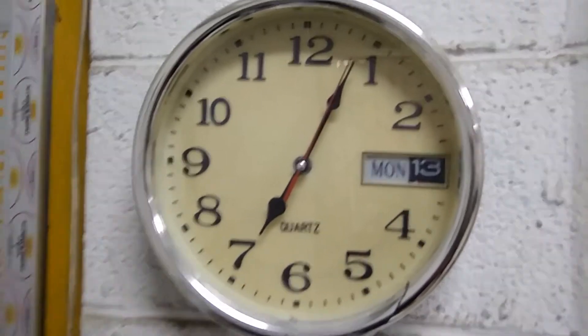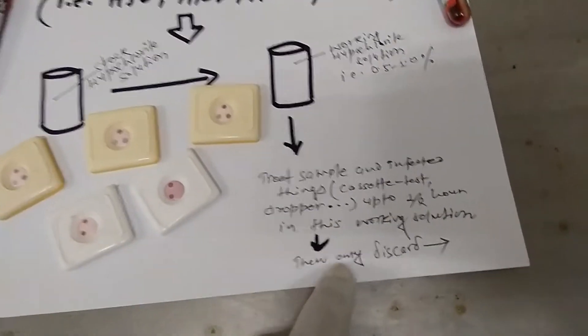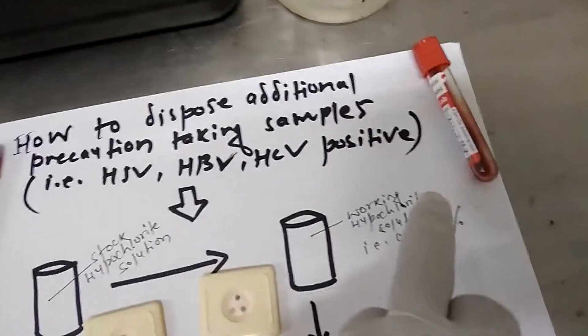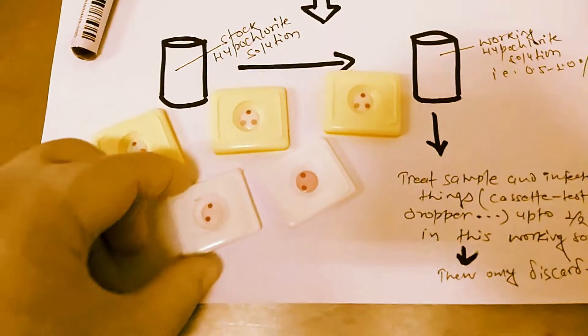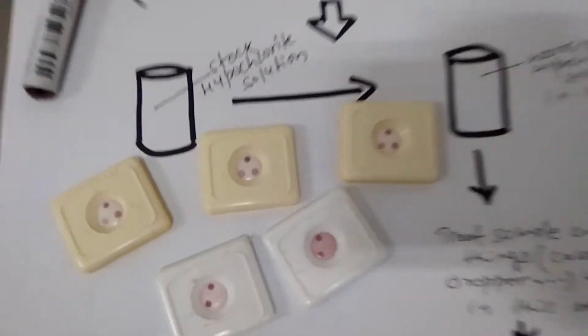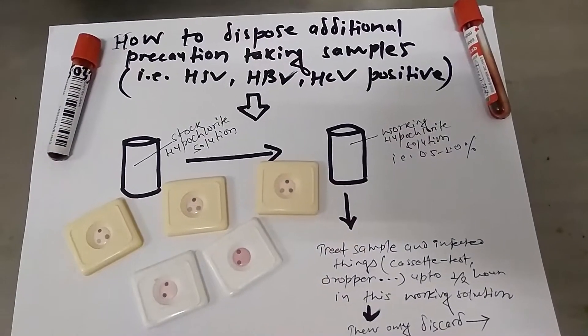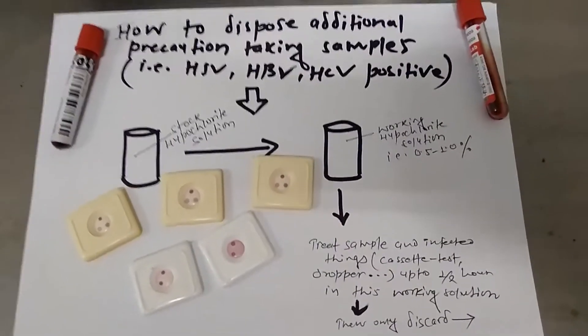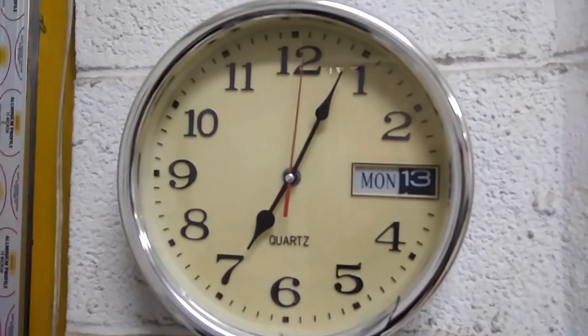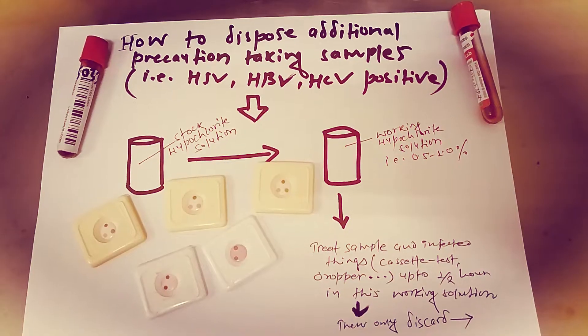Many laboratory workers asking one common question: how to decontaminate the floor if there is spoilage of HIV positive sample? Very simple - flood the floor with 0.5% hypochlorite solution and leave half an hour and finally clean.